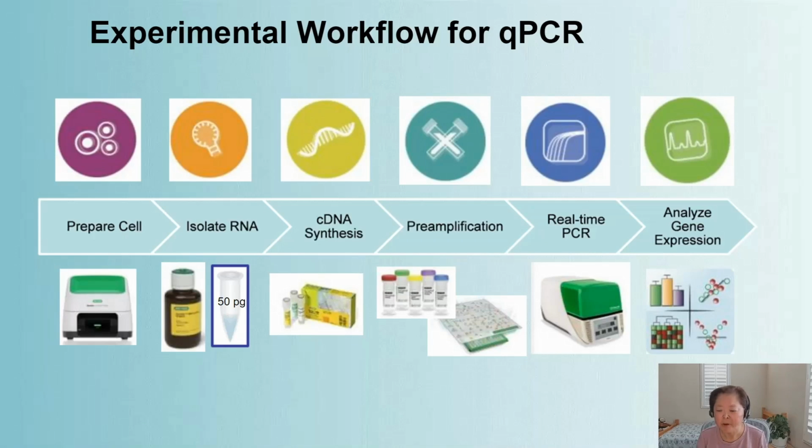Then, the number of the target genes and the reference genes in cDNA samples was evaluated using qPCR assays, and the relative expression of the target genes in both the cancer and the normal samples is calculated. Again here, we use Bio-Rad's SsoAdvanced Universal Supermix PCR reagent and CFX Opus instrument software to conduct the real-time PCR and to do the data analysis.